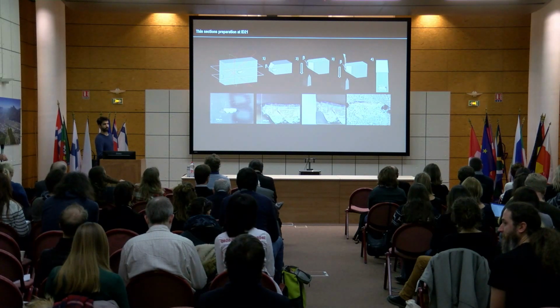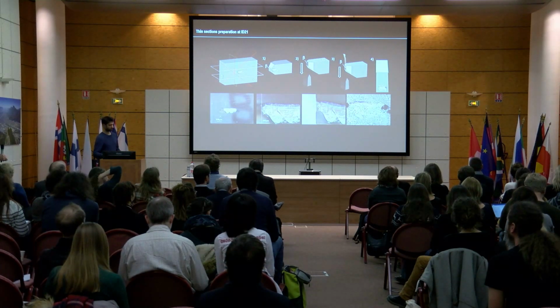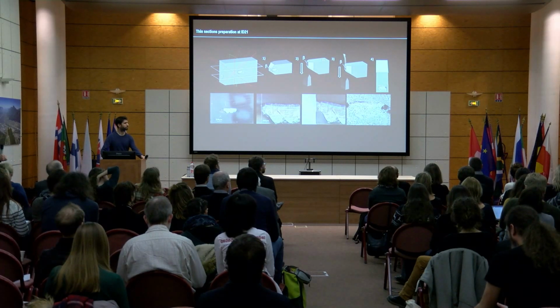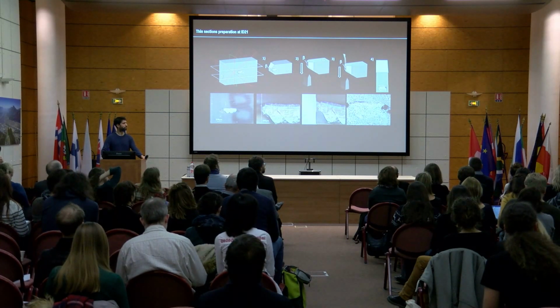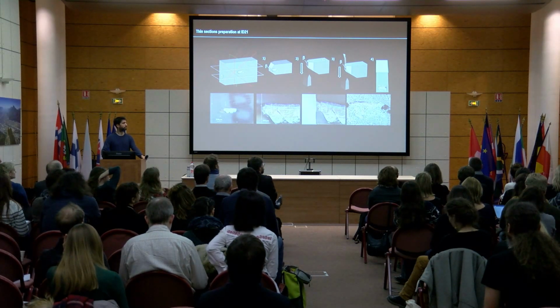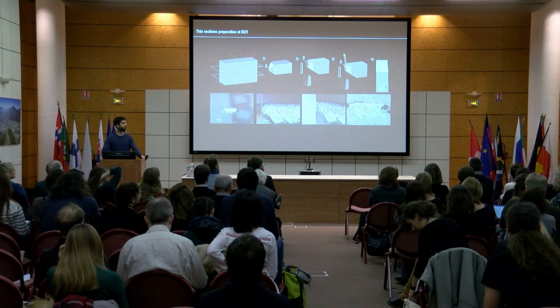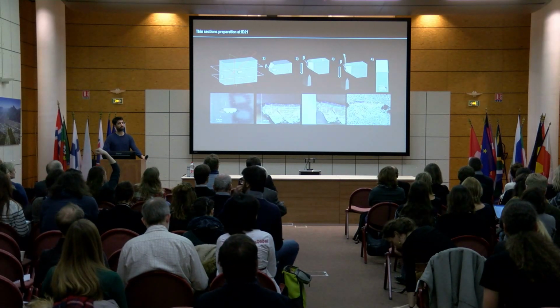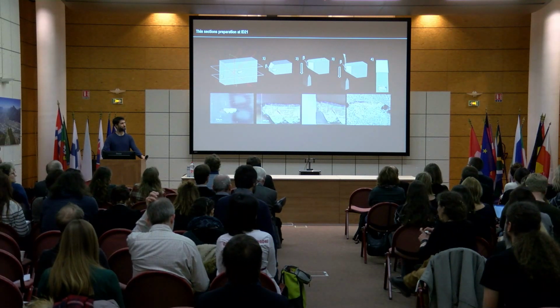What I like in making thin sections is that you have a very good control of the volume which is analyzed. In particular, when you do mapping in transmission with micro-X-ray diffraction, you know exactly the volume which is probed, and you have a good chance that the composition is homogeneous in the beam direction. So this is my advice.